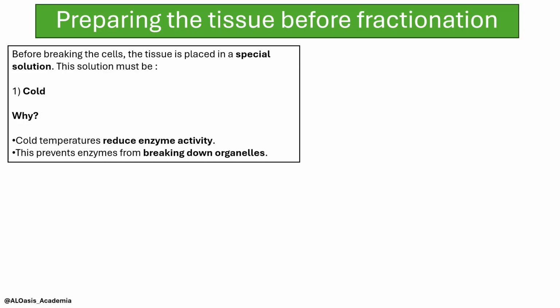Before breaking the cells, what we need to do is put the tissue in a special solution. That solution is special because it has specific conditions, or requirements, that it needs to meet. Otherwise, the tissue will be ruined and the organelles will be damaged.